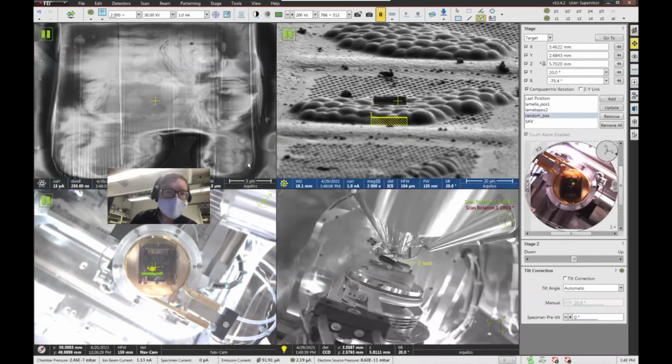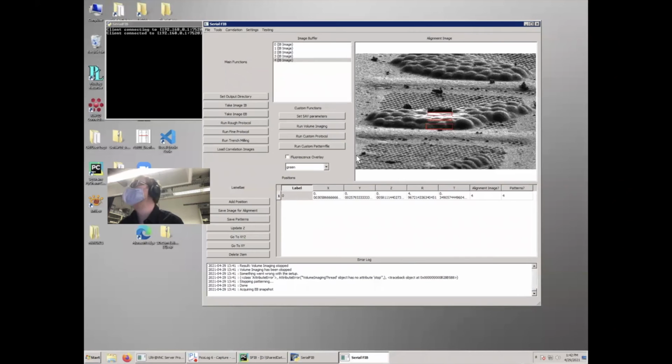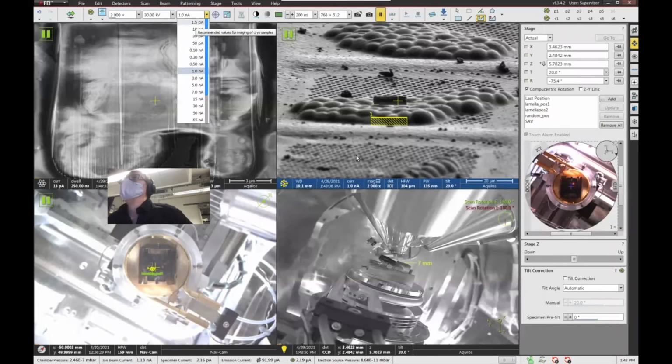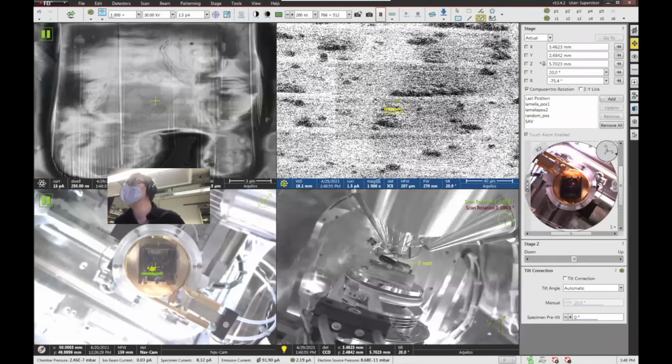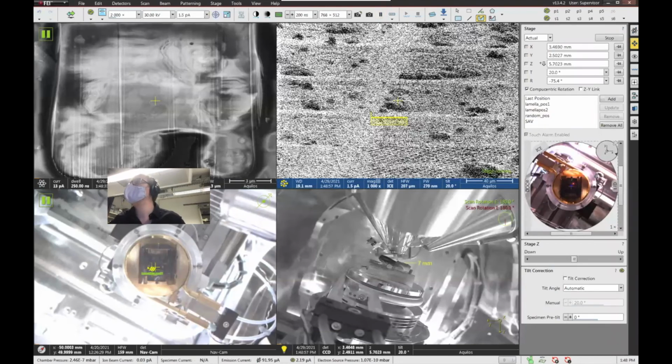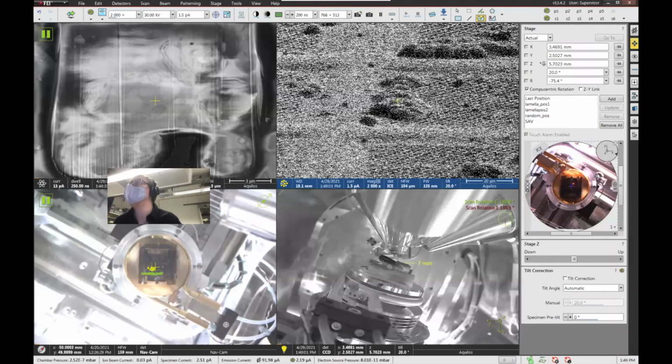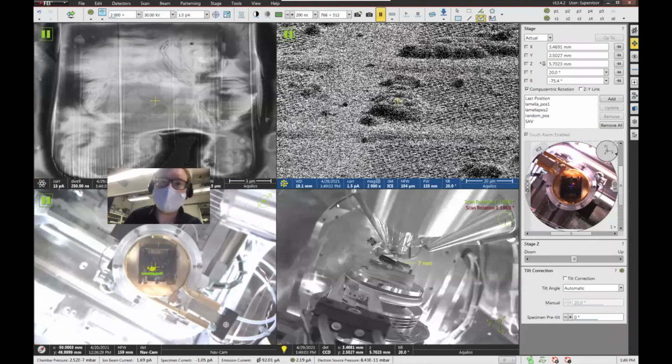Okay. Great. That stopped. Let's go to another position. Let's go to alignment current again. And the last thing that I wanted to show you was the pattern editor. So how to do things of your own that you want to do, whatever it might be.